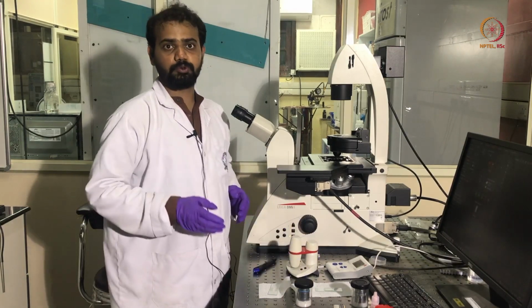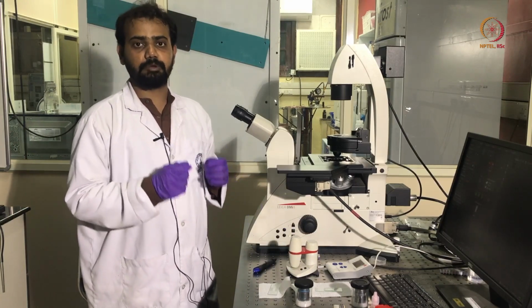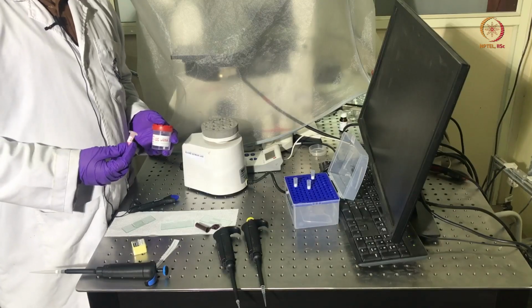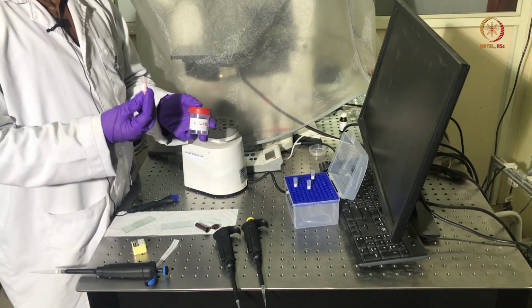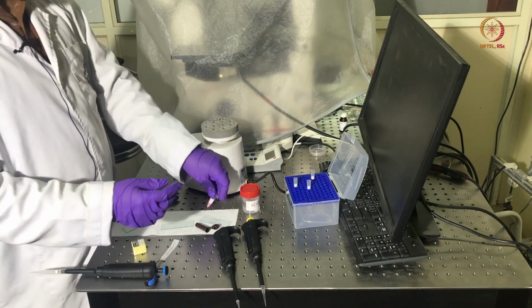Now we will move towards making a sample for the demonstration of Brownian motion. We will prepare the sample using DI water and red fluorescent polystyrene particles of 1.1 micrometer size.